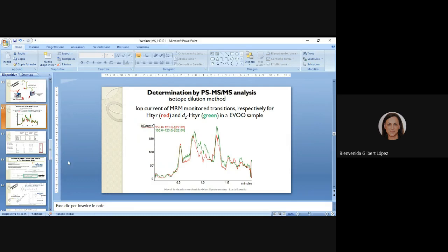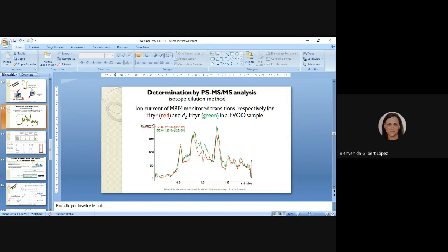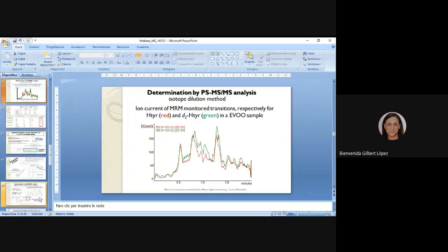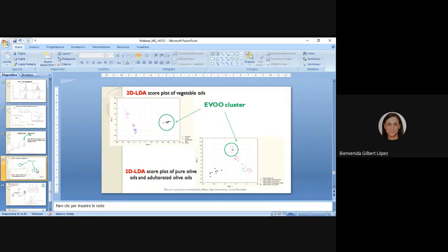Sorry, I have just one last question. In your last work, which is the minimum percentage of adulterant that you could detect to discriminate between real olive oil and adulterated olive oil?